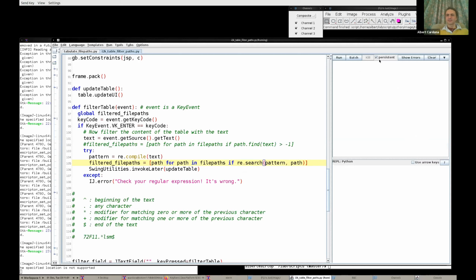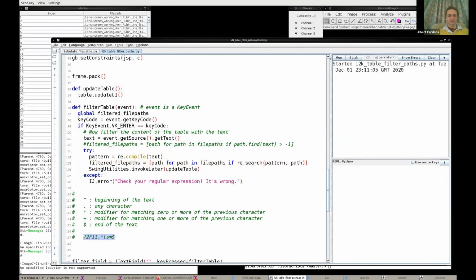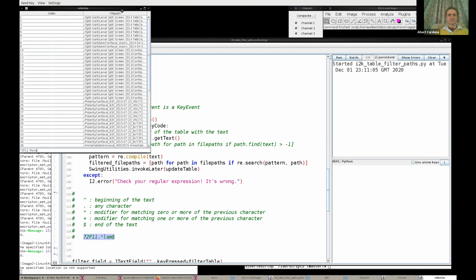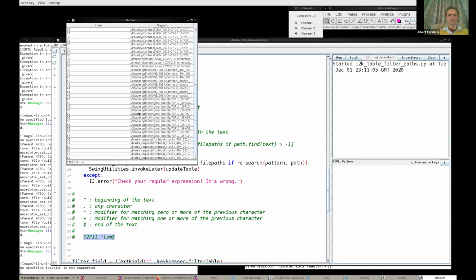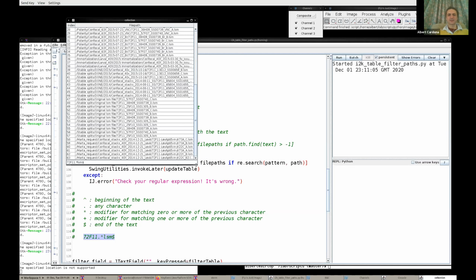So let's clear this. Let's make a new one. Let's run again. So fortunately, parsing text files is very fast. Now let's take our pattern and put it in this tiny text field. We should change the font really. Now it's filtering. And there it is, filtered. Instead of 700 something thousand, we only have 63 entries. And now these 63 entries give us the files that we want.